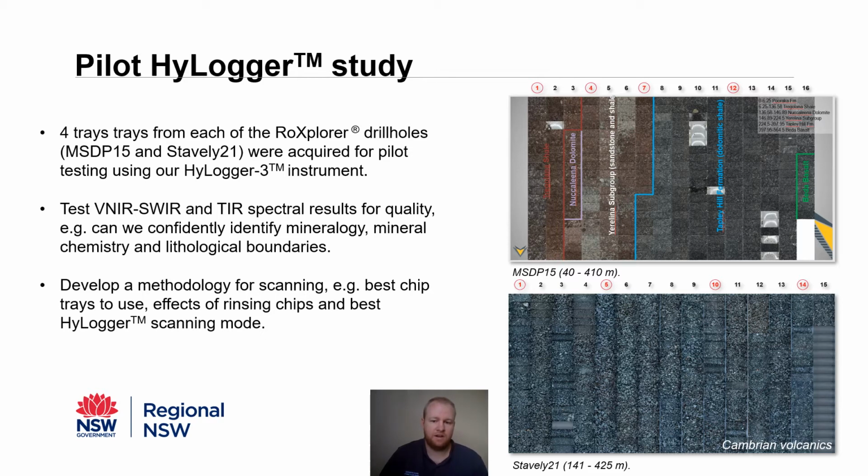Firstly, to test the VNIR to SWIR and TIR spectral results for quality. Can we confidently identify mineralogy, mineral chemistry and lithological boundaries in the same way we do with diamond drill core? And secondly, was to develop a workable methodology for scanning chips.